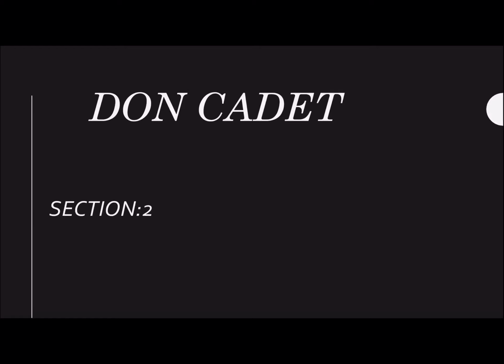Don Cadet, and I am enrolled in Section 2 of Organic Chemistry Lab with Mr. Paul. So today we'll be talking about ester, and we're getting this ester through a means of Fischer esterification. There are many ways of forming an ester, but that is the way that we'll be talking about today.